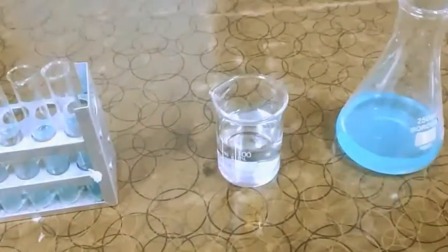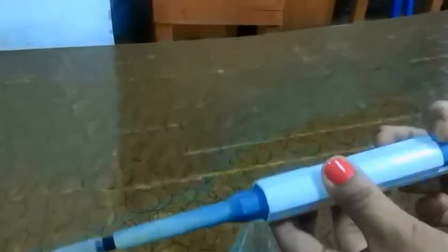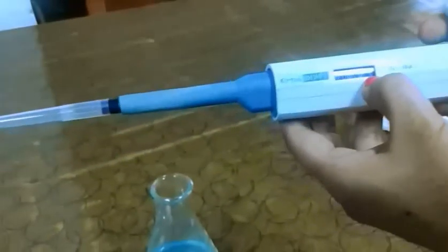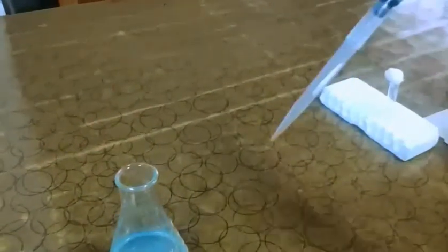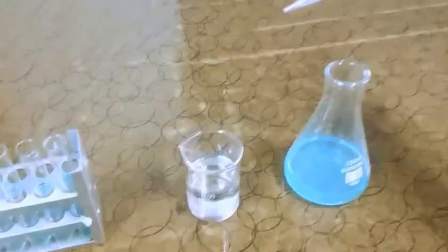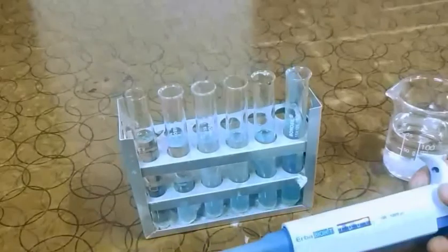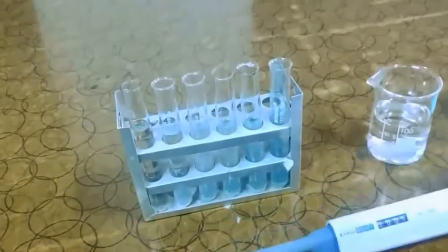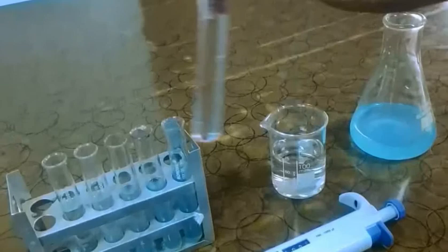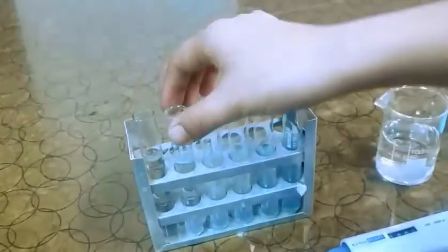This is the distilled water that I'm going to use as a blank, and with this micro pipette, which is of 1000 microliter capacity, equivalent to 1 ml, I'll be taking the solutions, the stock and distilled water, to fill up the test tubes. Like this I have taken distilled water from the distilled water beaker, and then this I'll be using as blank.